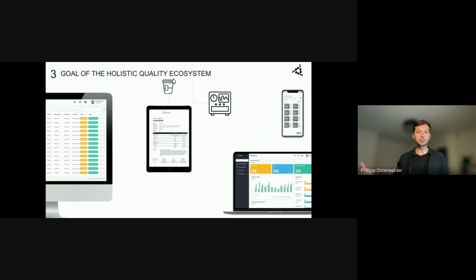You have in-process control, maybe directly from the production. You have batch control over the whole production by tracking temperature, pressure, throughput, and put all of this data directly to your quality data of the lot that gets produced, and send it further and enrich it with your ERP data.